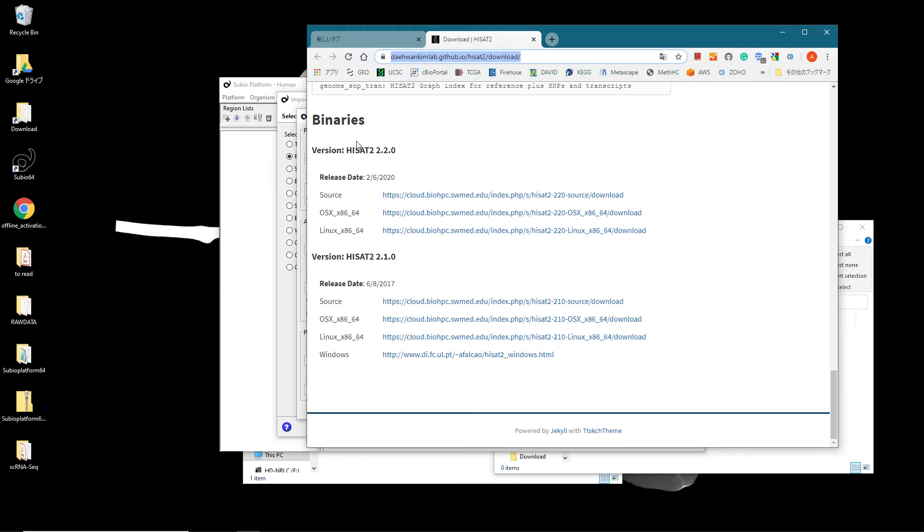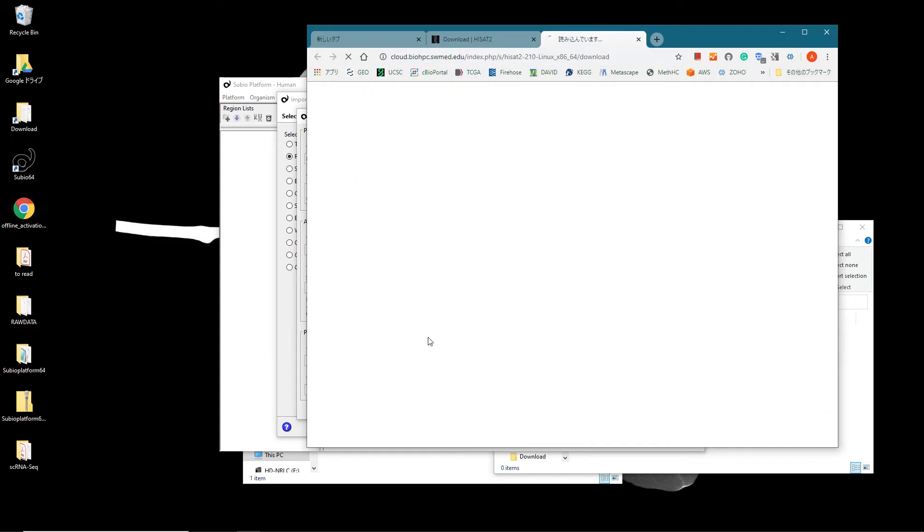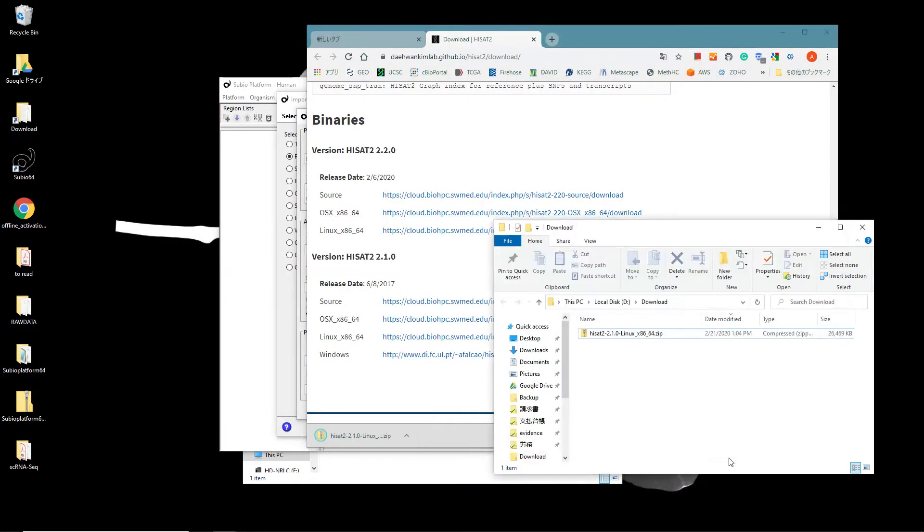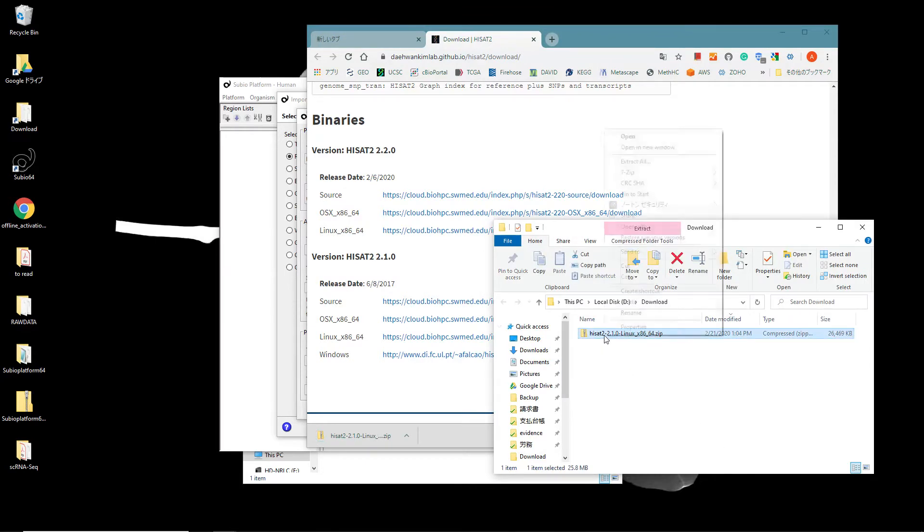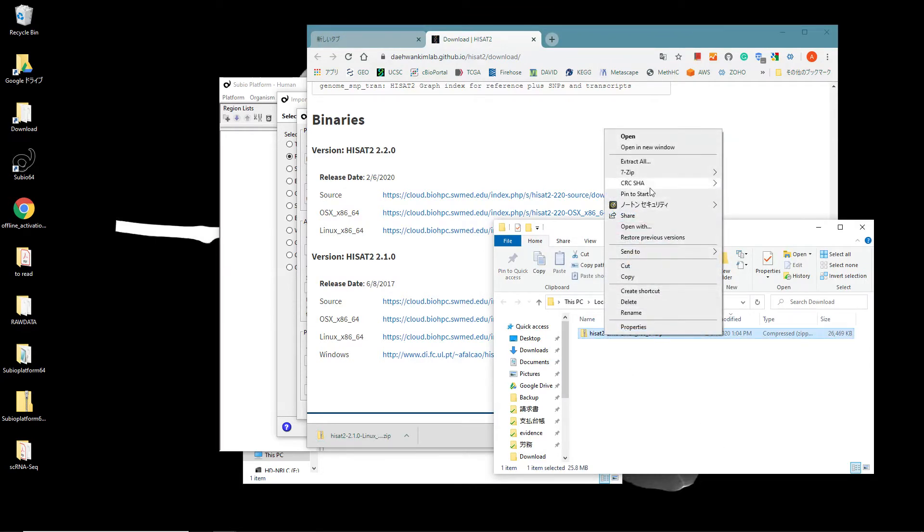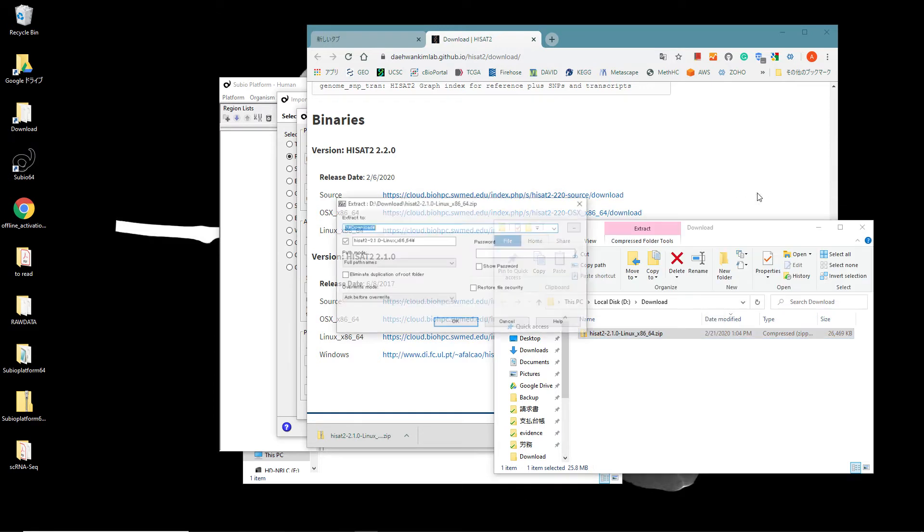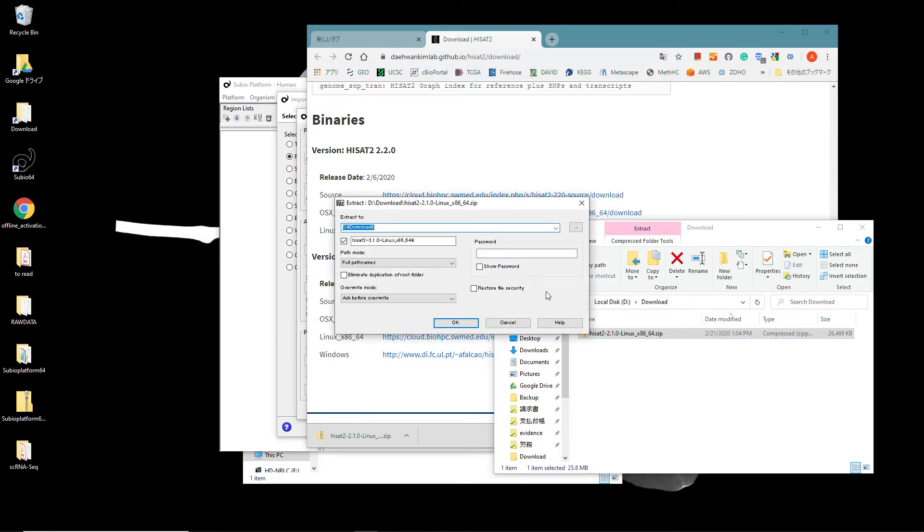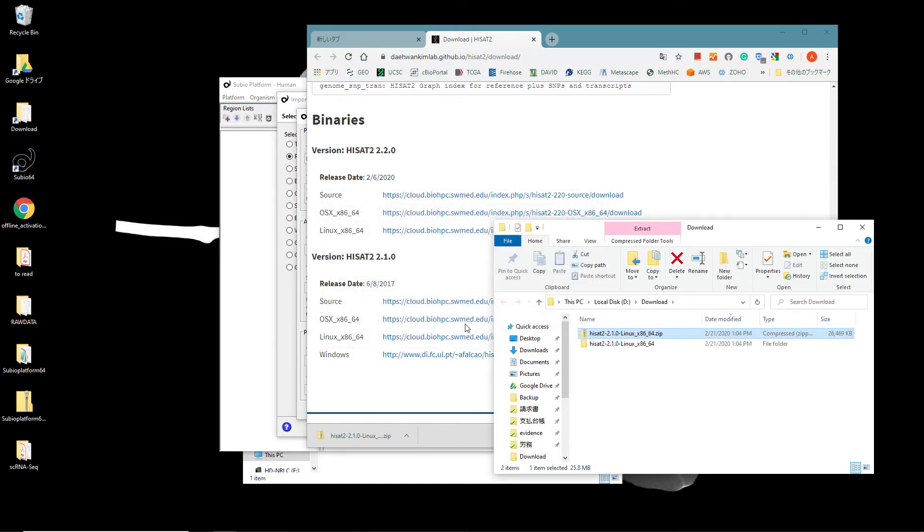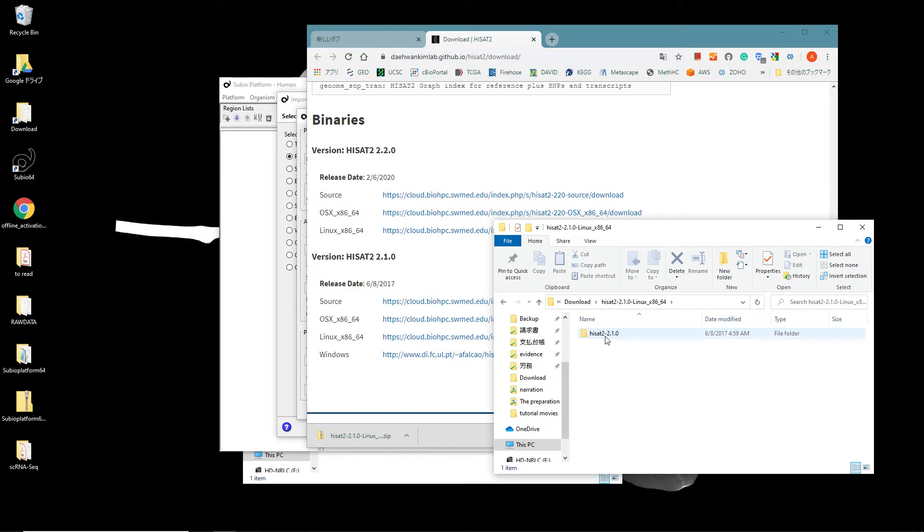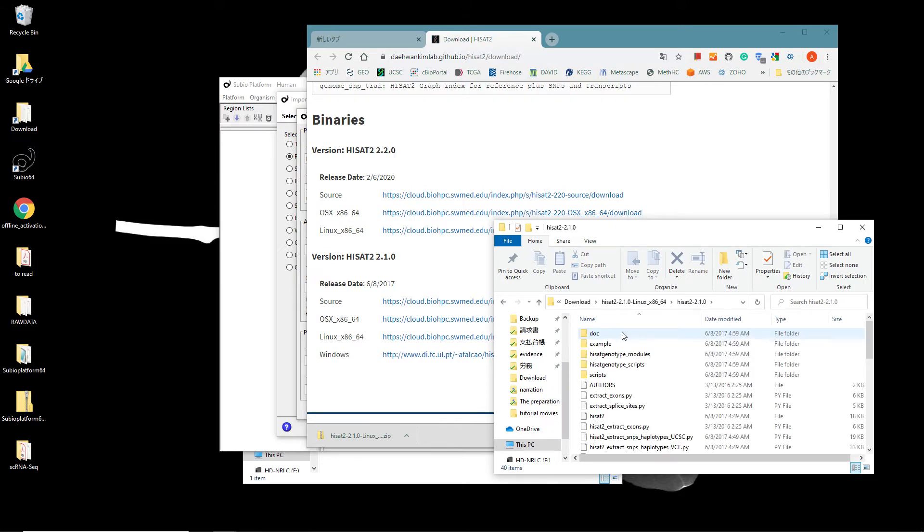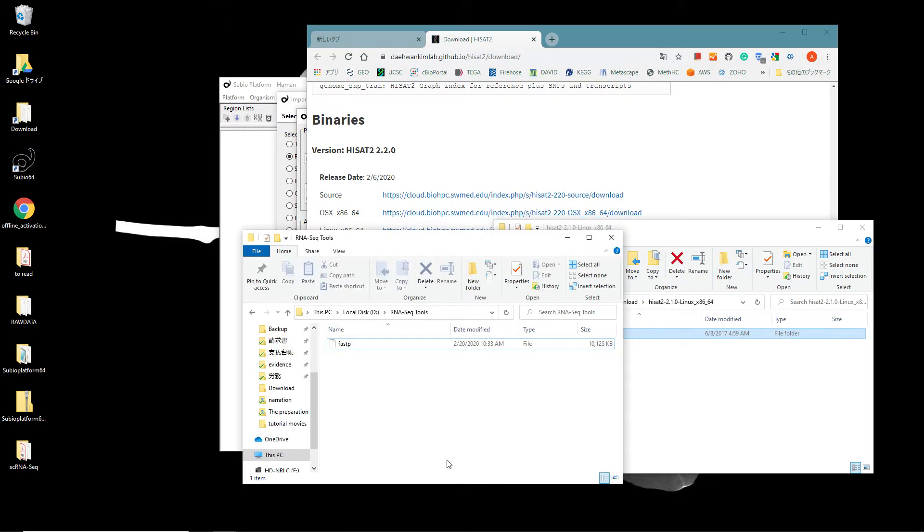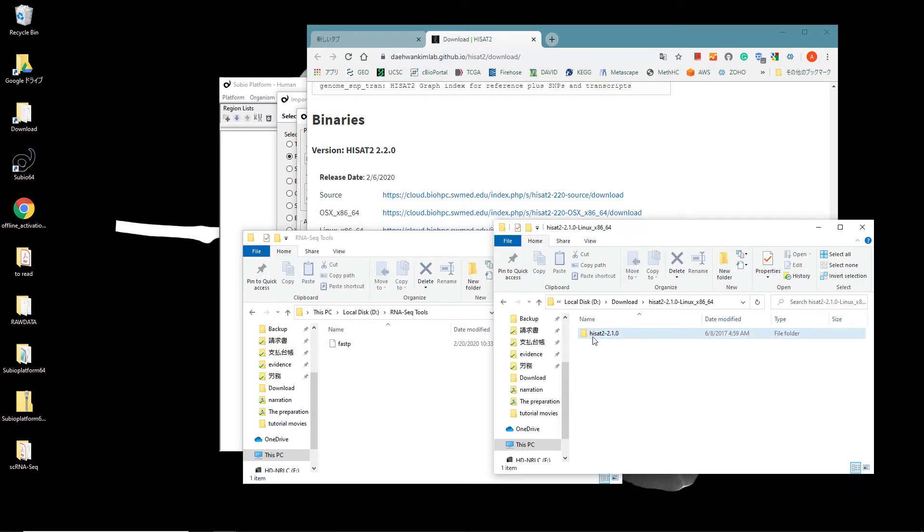Download the HISAT2 2.1.0 binary file for Linux systems. Please be informed that version 2.2.0 does not work well for this. Unarchive the downloaded .zip file to extract a folder. Move the folder under the RNA-Seq Tools folder.